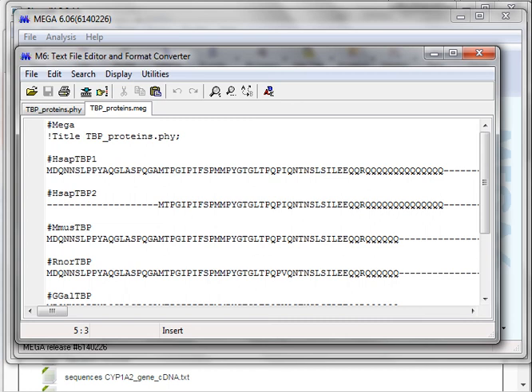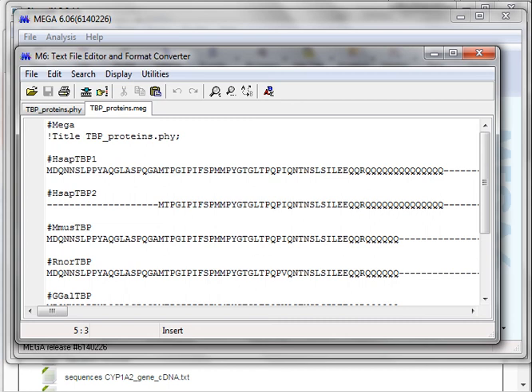OK, you can scale it out. You can place cutoff values differently. And you always return to your original. This is rectangular. This is traditional. And the original tree. You can always get it. So this way mainly represents equal distance. But it maintains the representation of close related homo sapiens with a common ancestor to other mammals and to birds with chicken representing. And so on. So you can have different ways of presenting your tree.